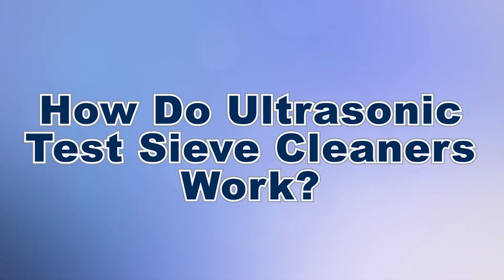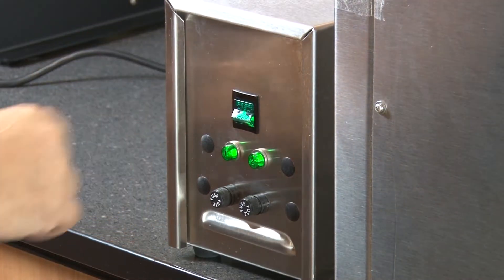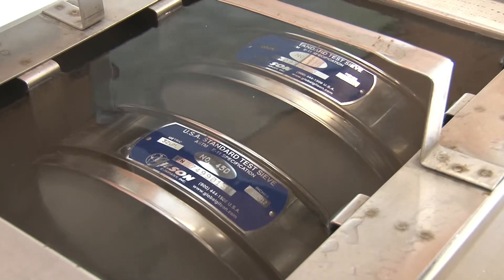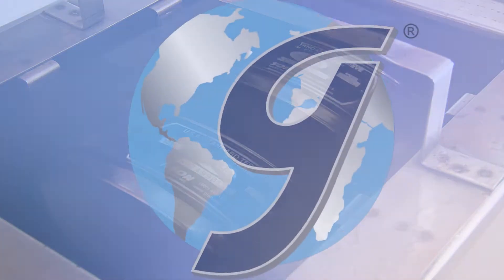Ultrasonic cleaners are widely used in material testing laboratories to clean test sieves and other instruments. A detergent-based cleaning fluid agitated by ultrasonic energy penetrates the most intricate openings of the immersed objects, quickly removing trapped particles and contaminants. Ultrasonic cleaning is the preferred method for cleaning sieves with fine mesh, especially sieves made with fragile precision electroform mesh.